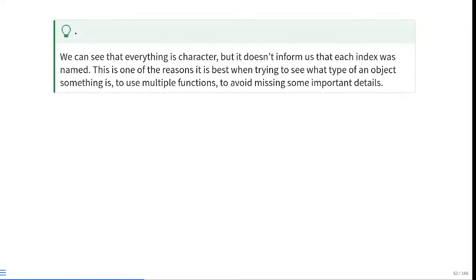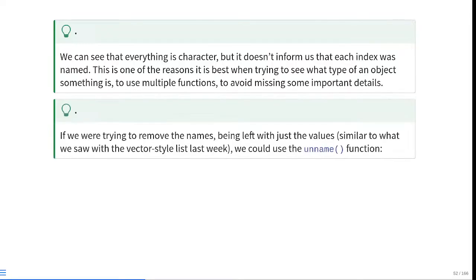And this is kind of the main reason why, if you have multiple ways of doing something in R, it's often useful to just go ahead and check, because it does provide additional information. Because if we had run class as our first information, we would have never seen these extra named variables that are present, and we wouldn't know they exist until potentially we see an error later on down the line, or we accidentally grab the P1N, P2N, or something like that. So it's always good to check multiple ways you know of how to go about and do something.